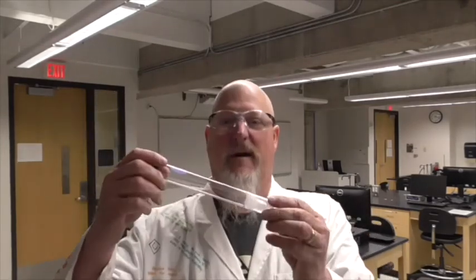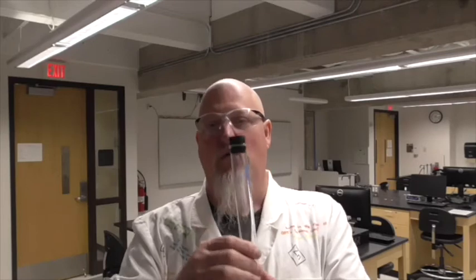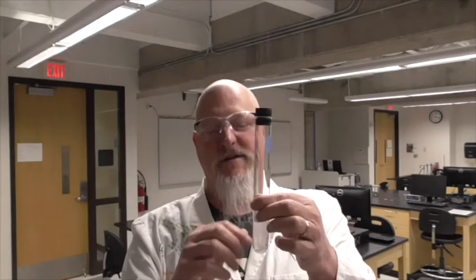The first is we're going to be given some paradichlorobenzene in a pretty large test tube, and we're going to melt the paradichlorobenzene, and then put it in a cool water bath, and watch as it crystallizes, as it freezes. So we're going to determine the freezing point of paradichlorobenzene, and we're going to do 2 trials of this. We're going to cool it down and take the temperature every 30 seconds, and then melt it again and do it again. So we're going to get the freezing point of paradichlorobenzene.